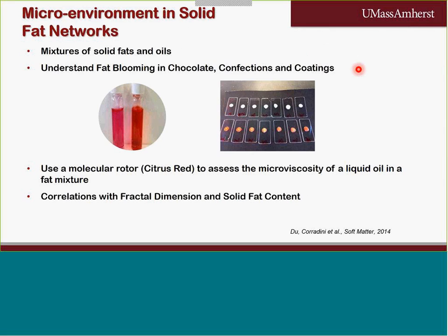So we used our blanks without the addition of the probe, and the same seed with the addition of citrus red, which is an edible synthetic dye approved for use on coating of oranges, especially in the United States. We measured the emission for both systems, and we correlated it with the fractal dimension of the fat networks and with solid fat content.